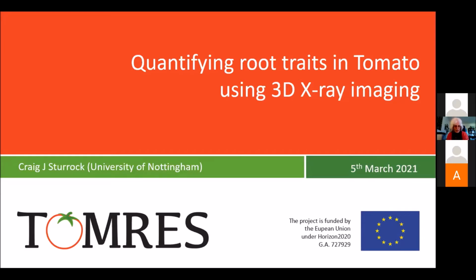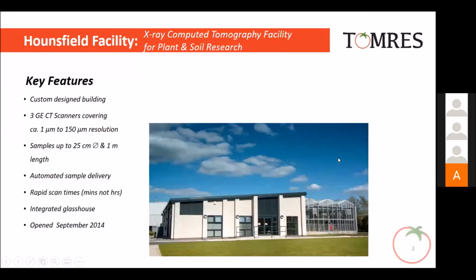Thanks, Hannah. Okay, good morning, everyone, and thanks for the opportunity to share some of the work that I've been involved with on the TOMRES project relating to the quantification of root traits in tomatoes using X-ray tomography.